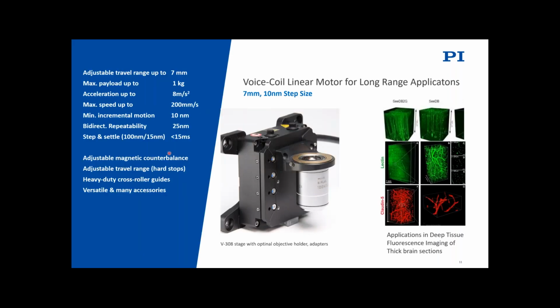Of course, sometimes we need to extend beyond even the hundreds of microns, maybe get into the millimeters of travel. And we have a whole myriad of technologies to do that. One that I'll discuss here is a voice coil stage. So a voice coil gets away from the traditional servo and stepper lead screws and ball screws.